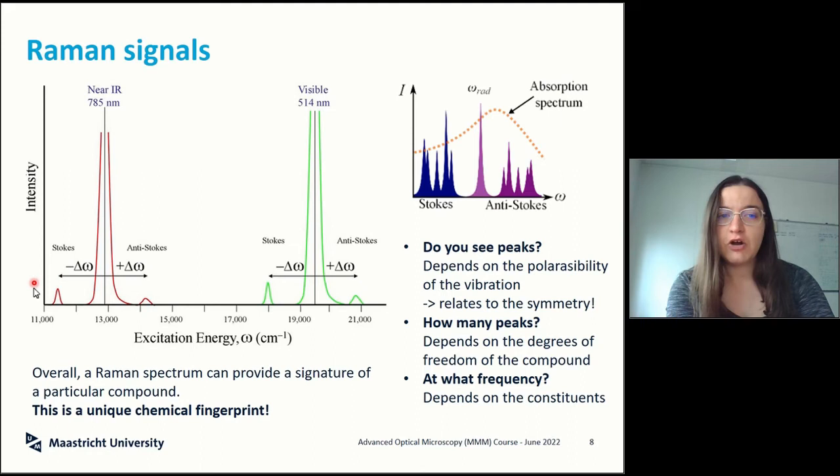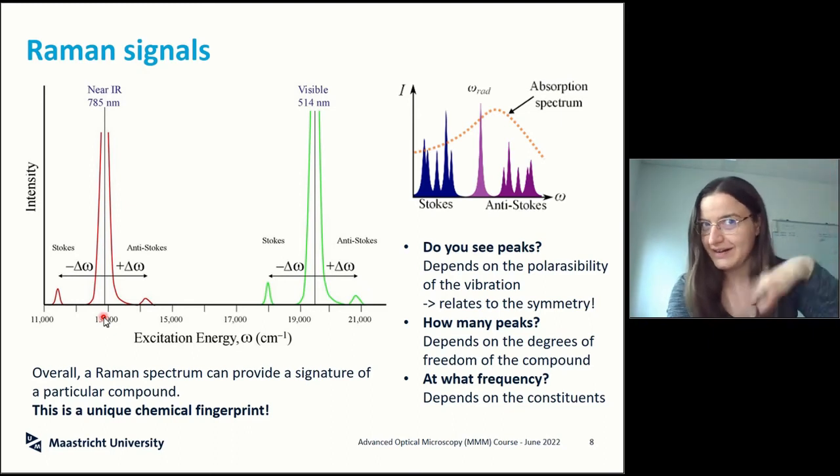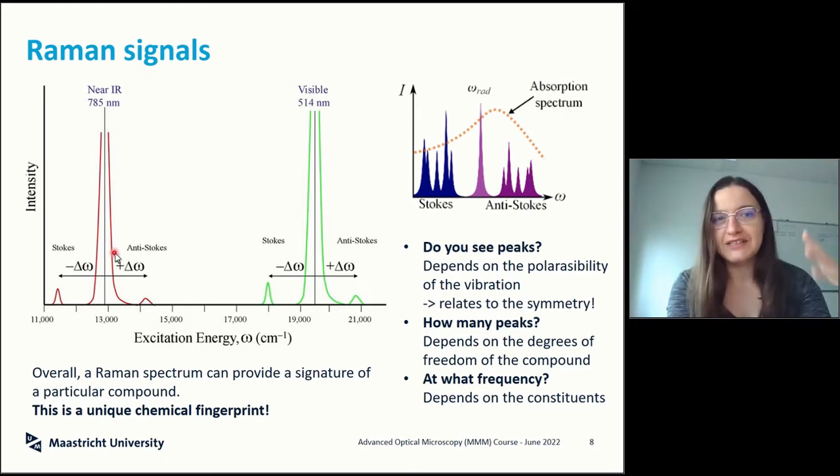And whatever comes here is structured in a way that is responding to whatever you have in a certain molecule that can vibrate and become partially responsive. I wouldn't say excited, because excited is that thing up there and it's incorrect, but something that can be responsive to your incident light.